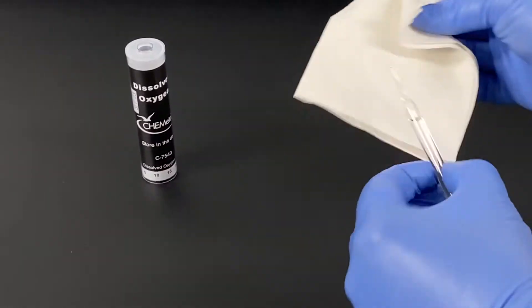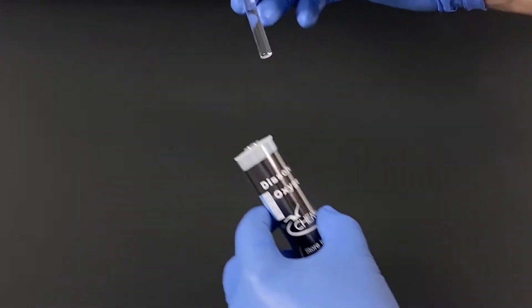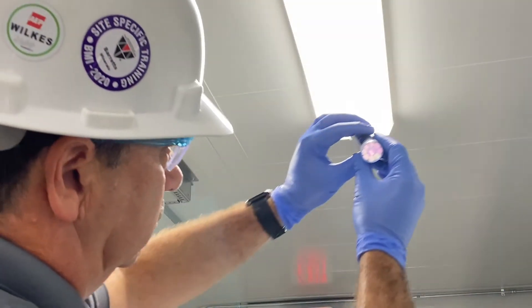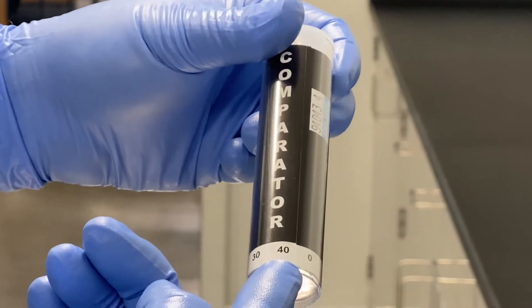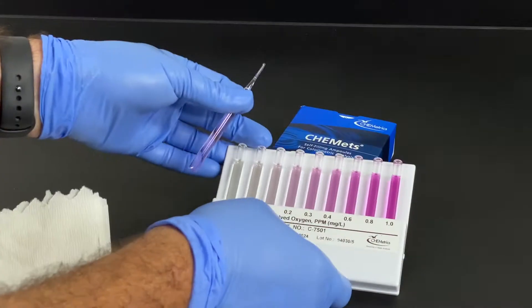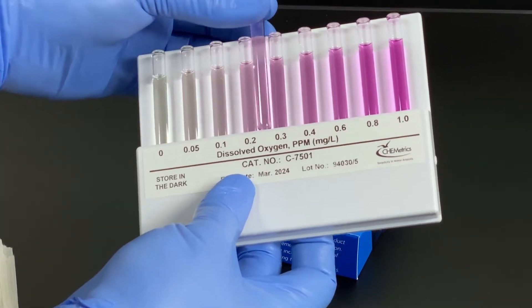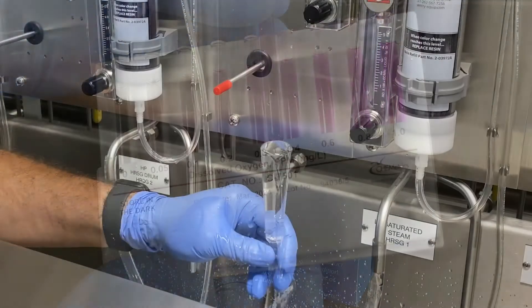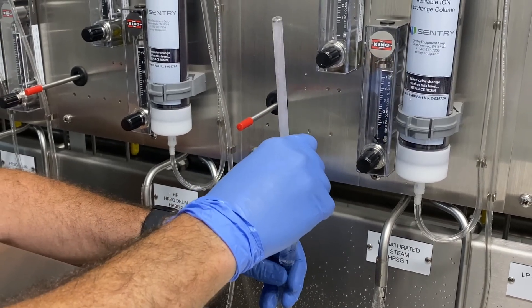For the low-range dissolved oxygen test, dry the ampoule and insert it into the round comparator. Hold the comparator up to a source of light and view from the bottom, rotating the barrel until the best color match is found. For the high-range test, compare the ampoule to standards in the provided flat comparator. Tests using ultra-low-range ampoules are conducted in similar fashion.